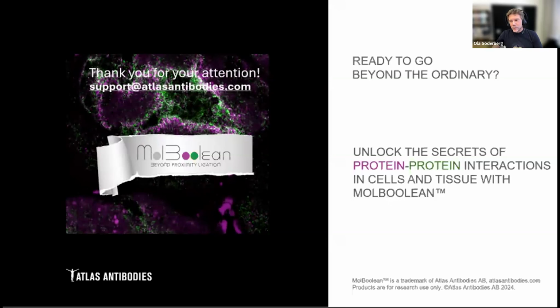But I think antibodies are probably where we lose most. If you have an added antibody and it binds maybe 30% of the epitopes, and another antibody binds 10% of the epitopes, there will be a bias. So what you need to look at is the difference between situations. If you add a drug or stimulus, does it change the relative abundance of complexes compared to protein expression?